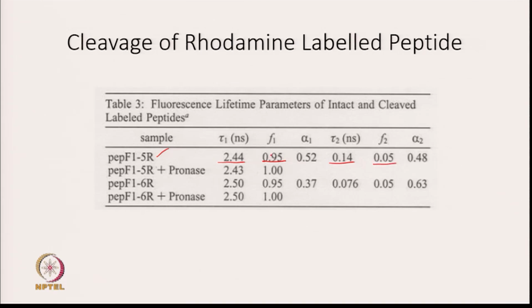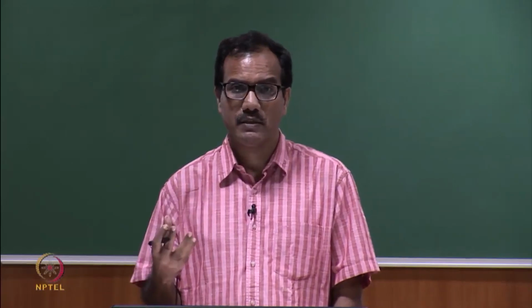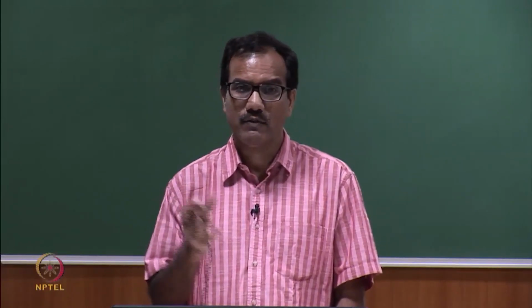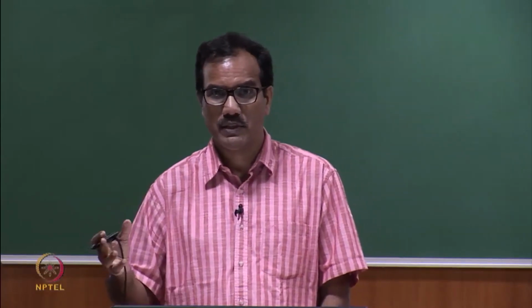So, most of the fluorophore decays with this lifetime, only 5% of fluorophore decay by this lifetime. What does this tell you? That the peptide, when it is not cleaved, has two conformations. One conformation contributes 95%, another conformation contributes 5%.